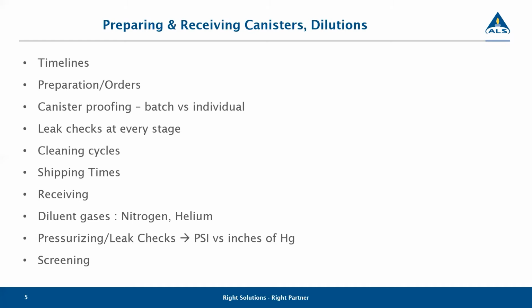The equipment for the flow controllers goes through exactly that same process, heating and purging. Now we don't purge them with nitrogen, we heat them and we clean them. We do purge the individual lines, but we heat them and we clean the individual components of the flow controllers. The canisters are actually connected in the oven. If you were to look in our ovens, they're connected up just with quick connects in order to allow for the heating and purging process.